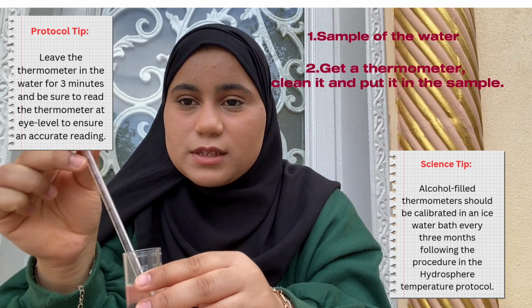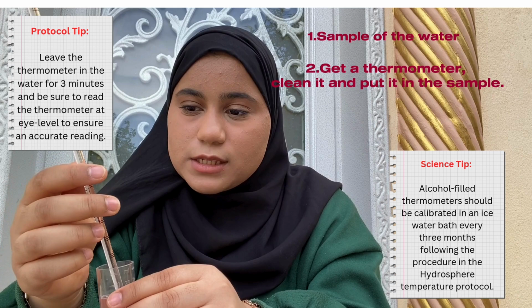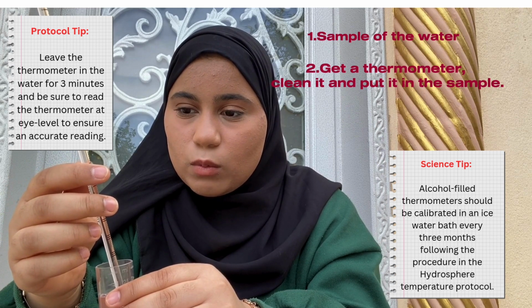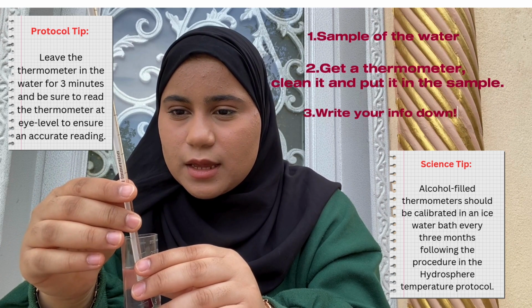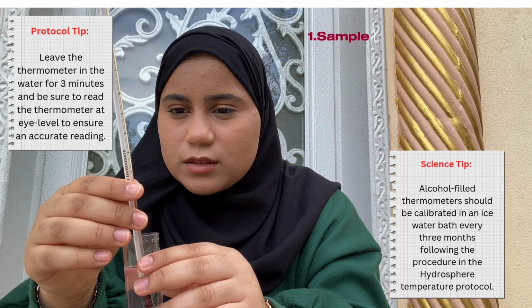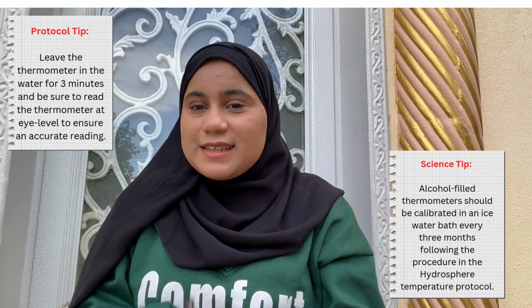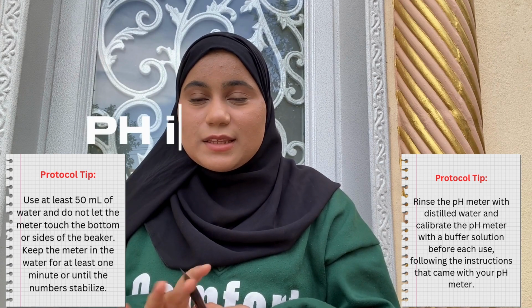You're just going to pop this in there like that and wait to see where it stops. So mine, I think it's at 17.